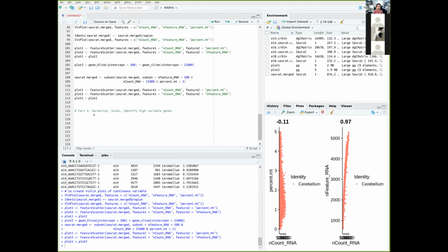Don't worry, you will have this package because it will be installed as part of Seurat. It's not Seurat, it's a different package that they created, but it will be loaded together, if you understand what I mean. And the function is scTransform.